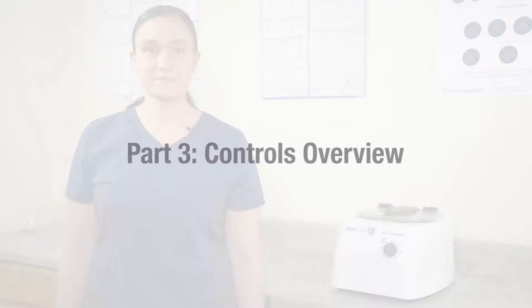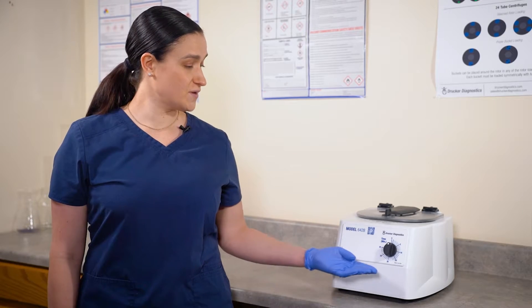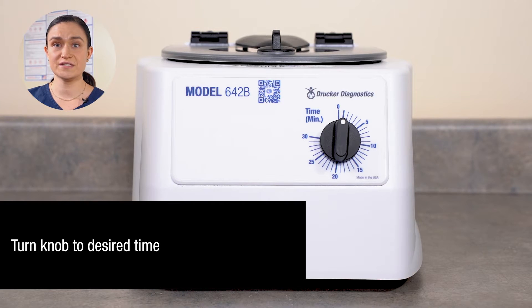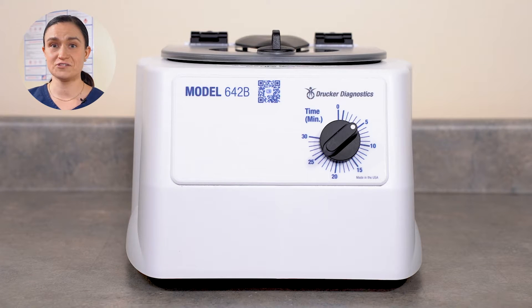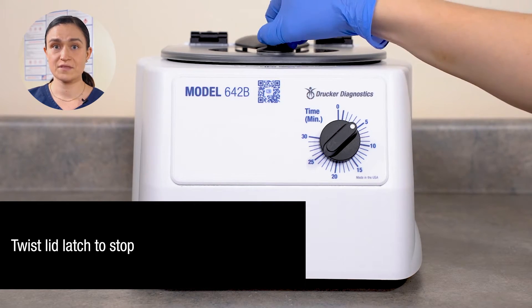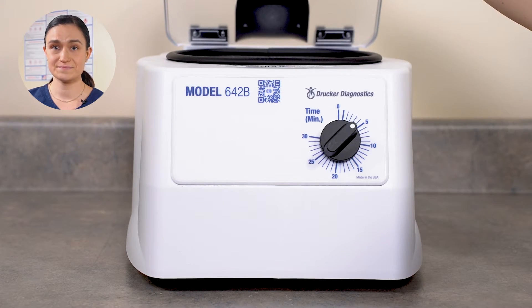Part 3: Controls Overview. Your 642B runs at a speed of 3400 RPM, or 1600 x g. Your time is adjustable. Today we're going to learn how to adjust that time and how that time adjustment operates your centrifuge. Your 642B has all of its controls right here on the front panel. This knob here controls the time — it is also the centrifuge's on switch. The numbers around the timer knob indicate minutes of spin. To start the 642B, simply turn the dial to the number of minutes you want to spin. The centrifuge will start automatically. The rotor will begin to accelerate, and the centrifuge will run for the time selected before slowing down. To stop the centrifuge mid-cycle, simply twist the lid latch. The rotor will immediately begin slowing down. Once it has come to a full stop, you may open the lid and remove your samples. And those are your controls.